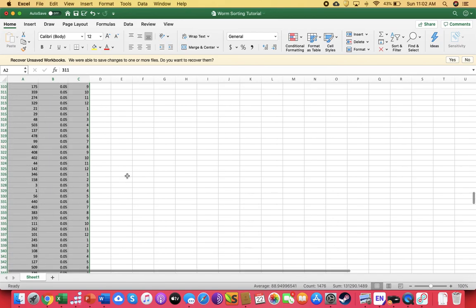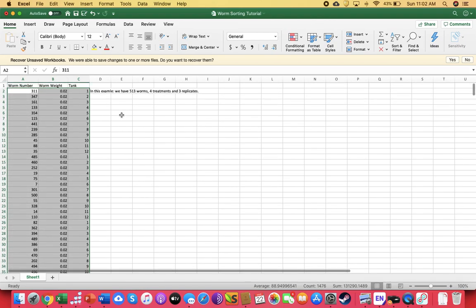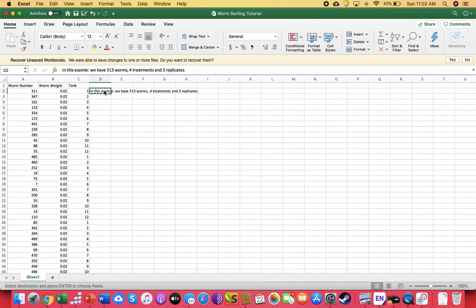All right, so that means that at the very least, I'm going to just move this over here for a minute. You know that worm 311 goes into tank 1, worm 347 goes into tank 2, worm 161 goes into tank 3, etc.